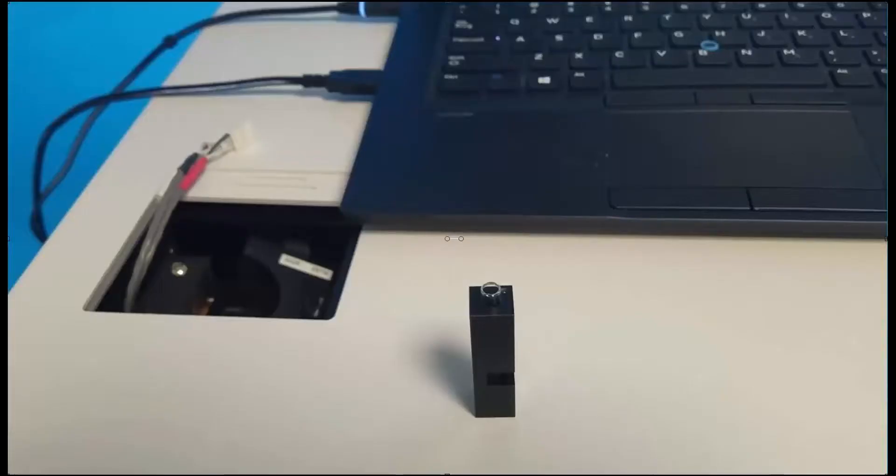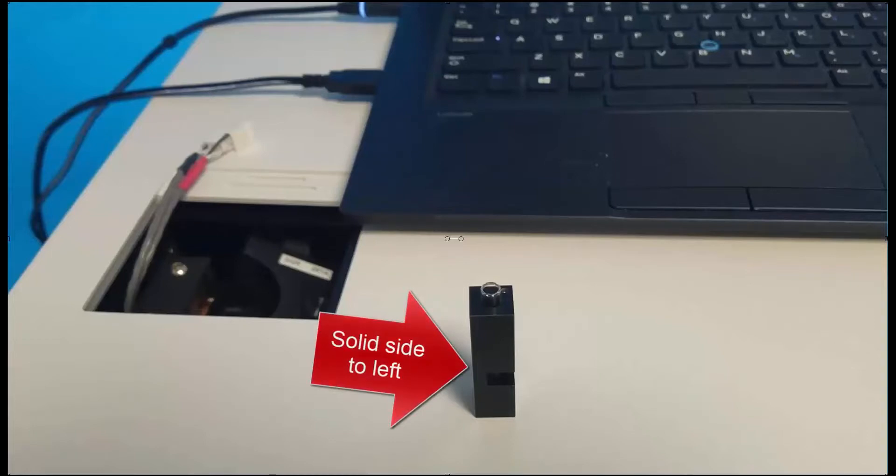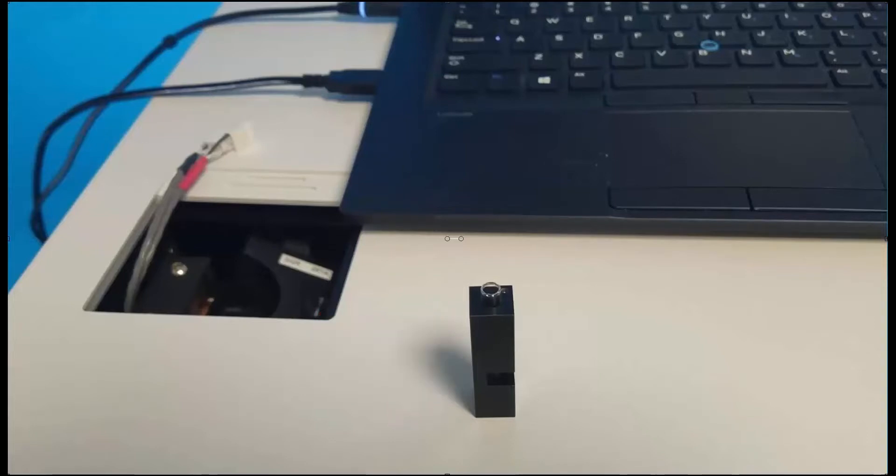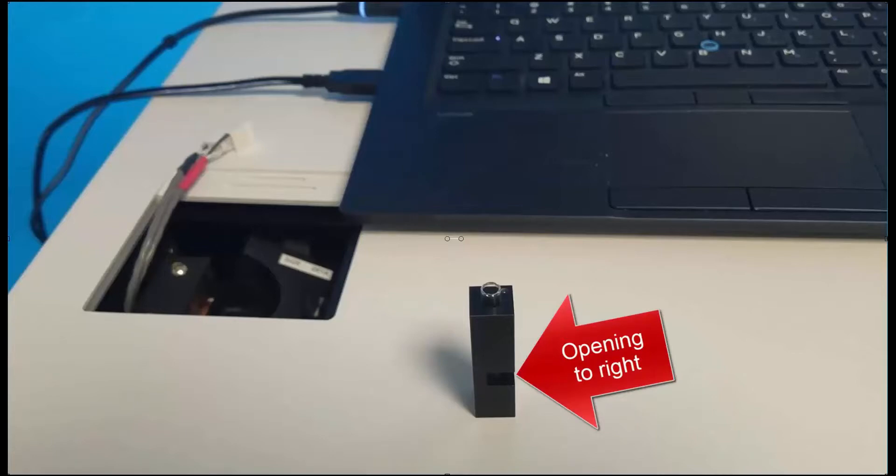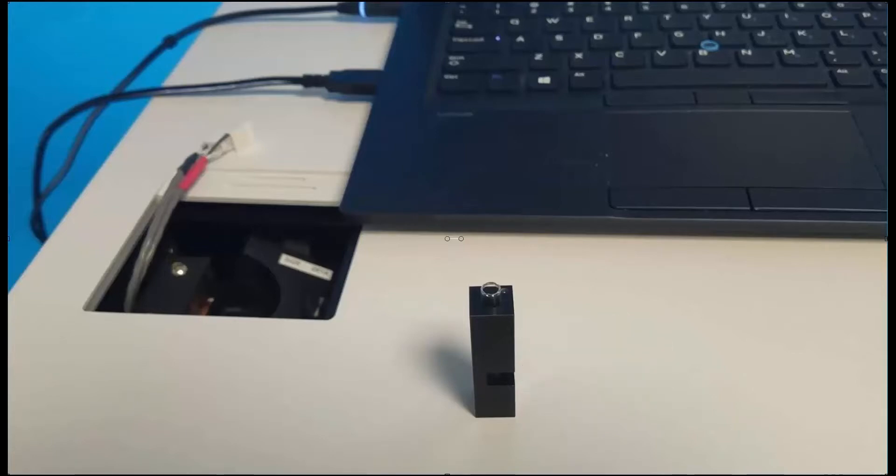The orientation of the cell as we place it in the instrument for measurement is important. As we face the front of the instrument we want the solid metallic side to the left and this cutaway where the measurement is made facing to the right as we place it into the cell holder.